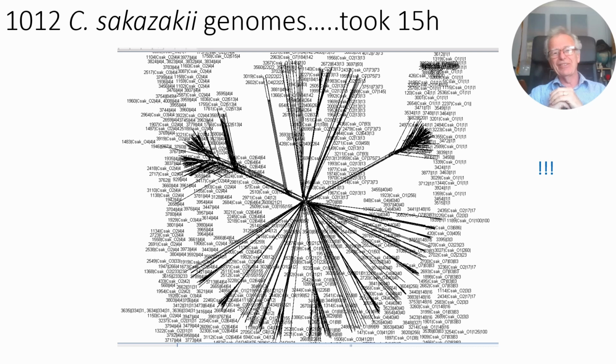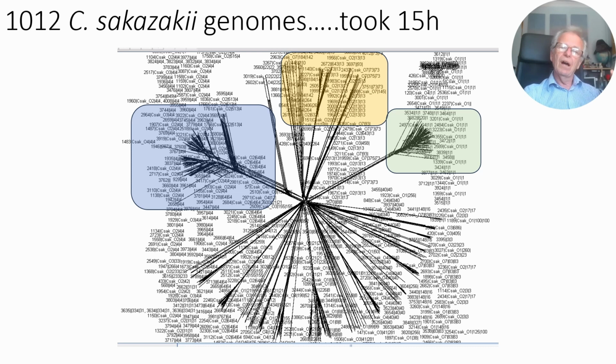but it's really fascinating that immediately you can see the structure. You can see there are strains which are being clustered together here. There are strains being clustered together over here. And just for the purpose of illustrating genomic analysis, I'm just going to show you briefly these three areas of the SplitsTree.